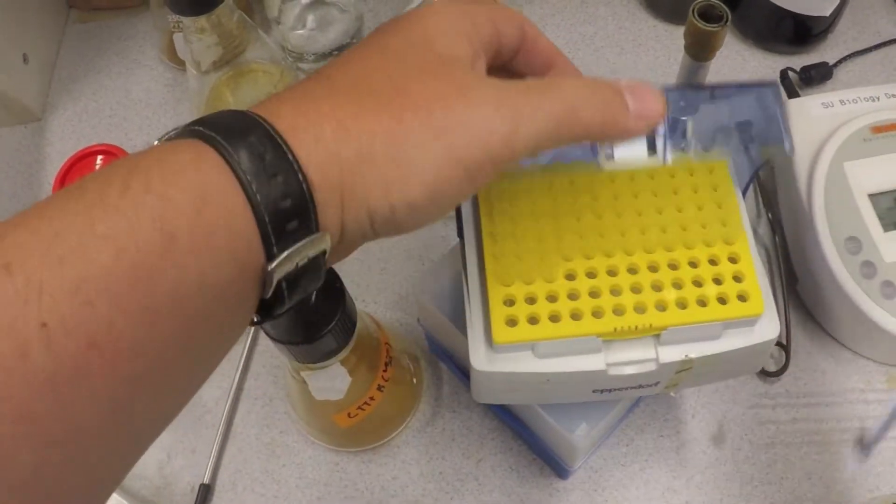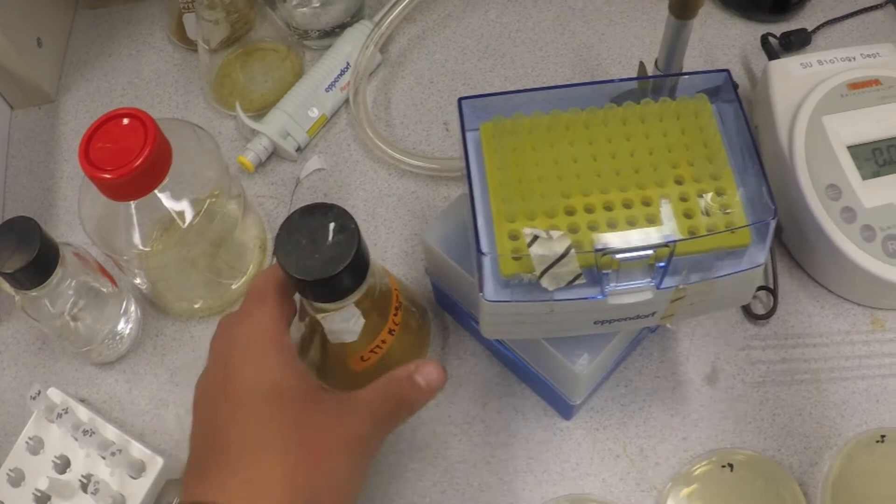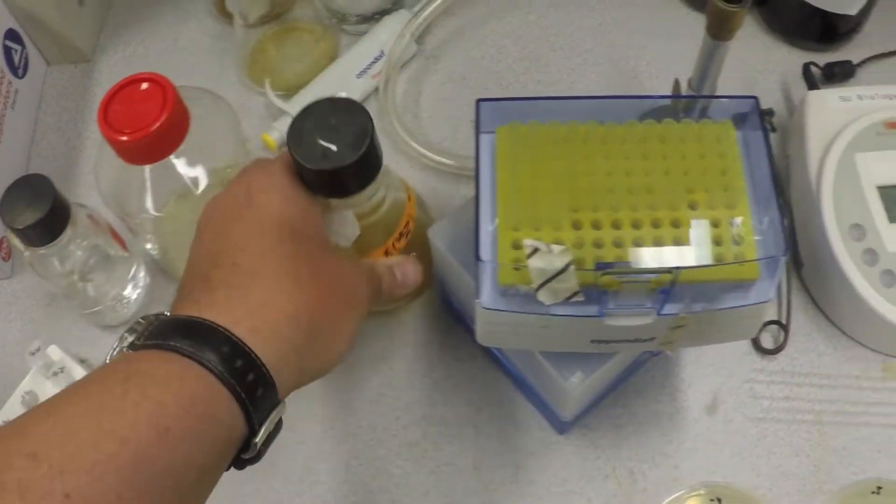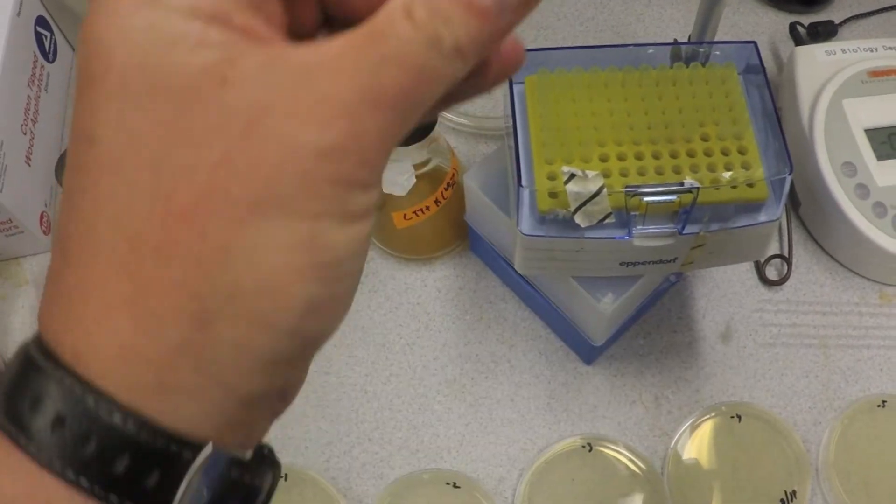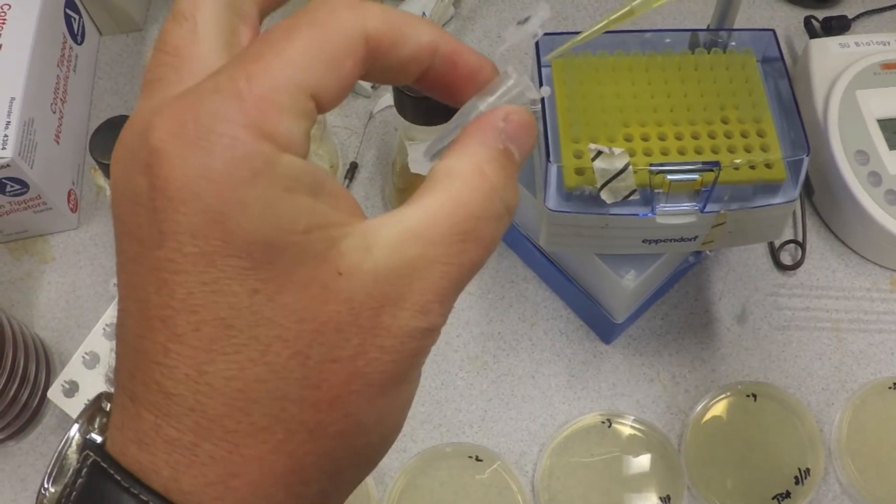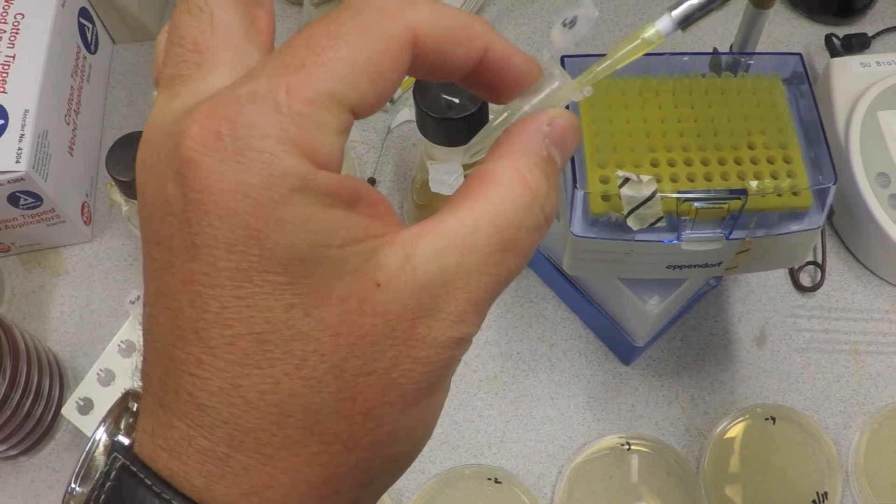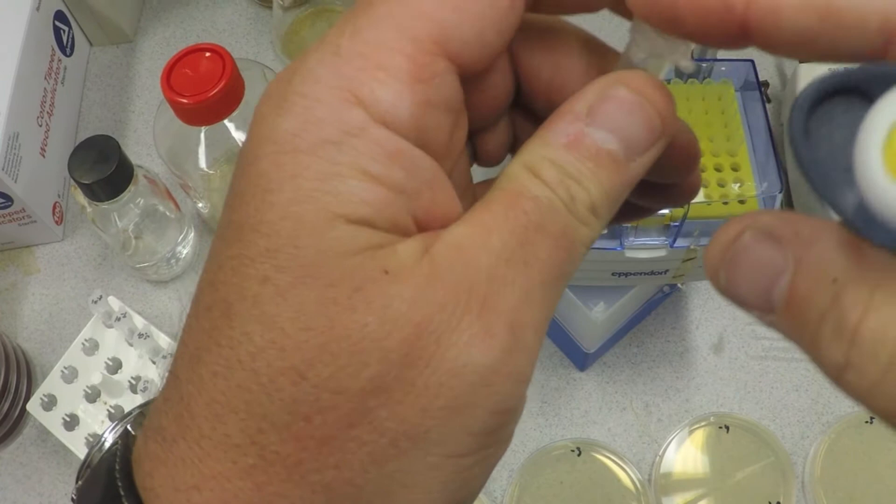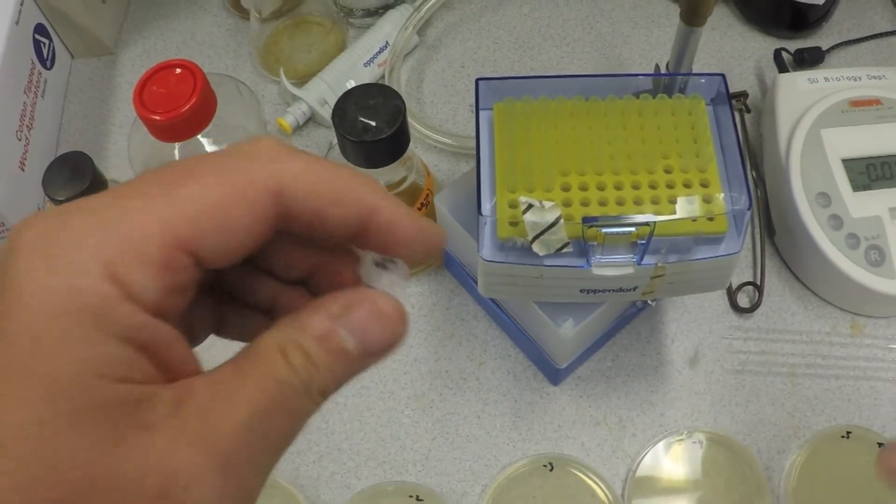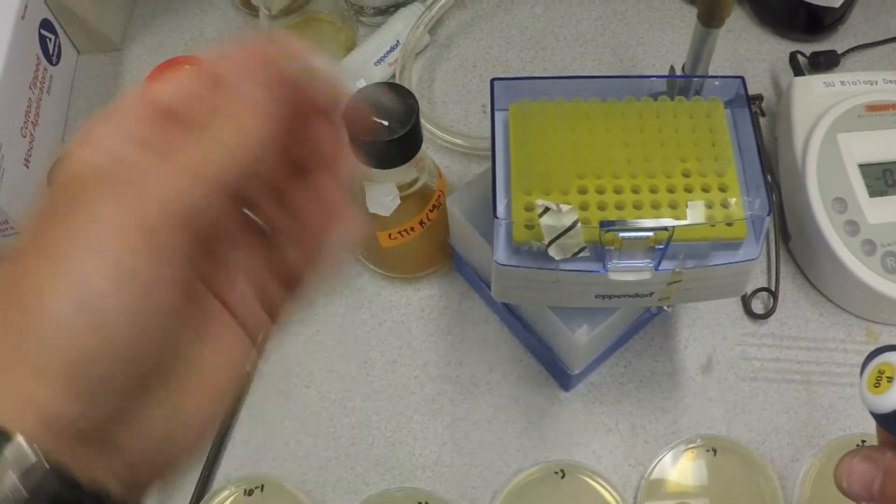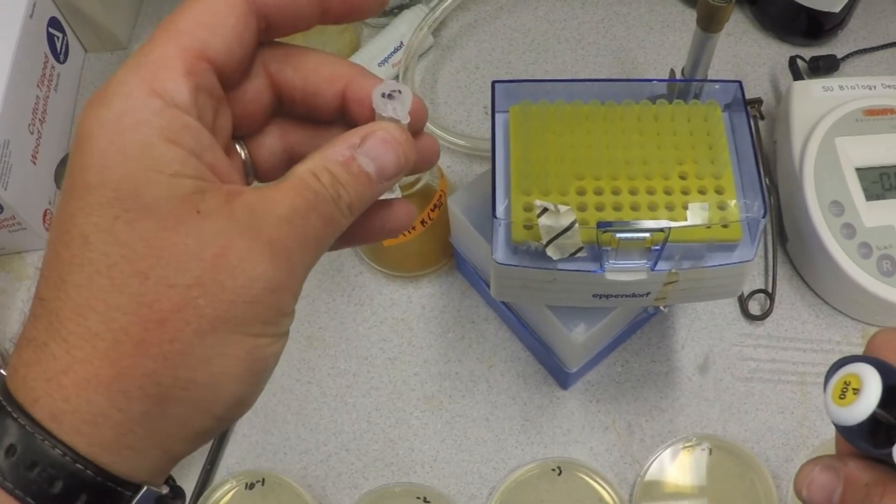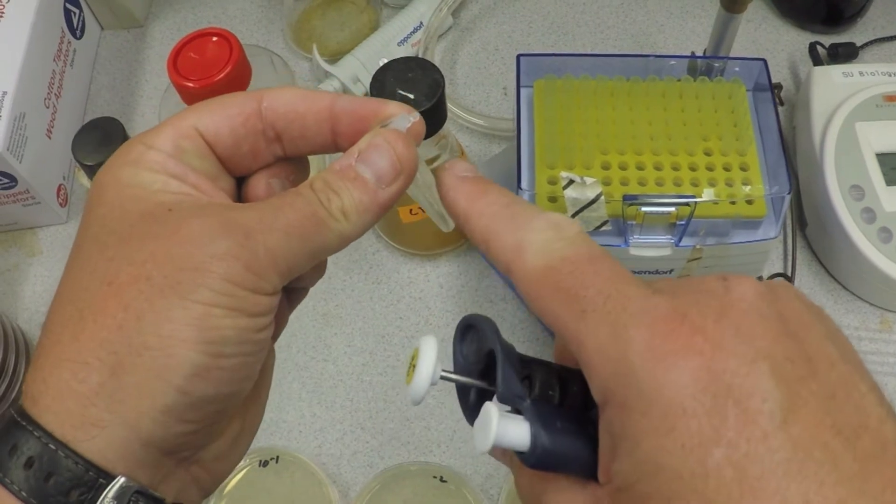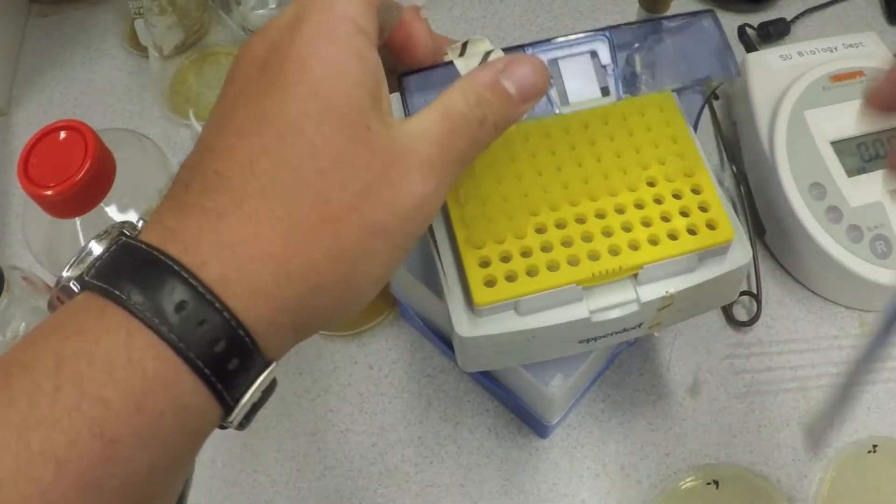So we go ahead and we take our sample and we put it in to our 1 to 10 tube, and we pipette up and down, get rid of the excess, put your tip into a biohazard bag, shake that up two or three times. Now this is a mix, this is a 1 to 10 dilution. Now I want to make a serial dilution of that, so we take another tip.